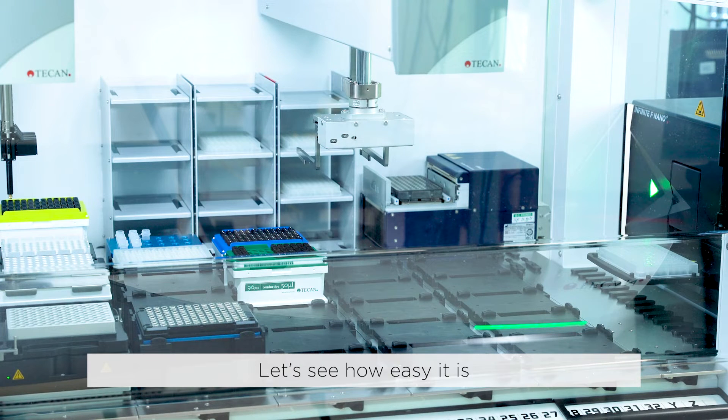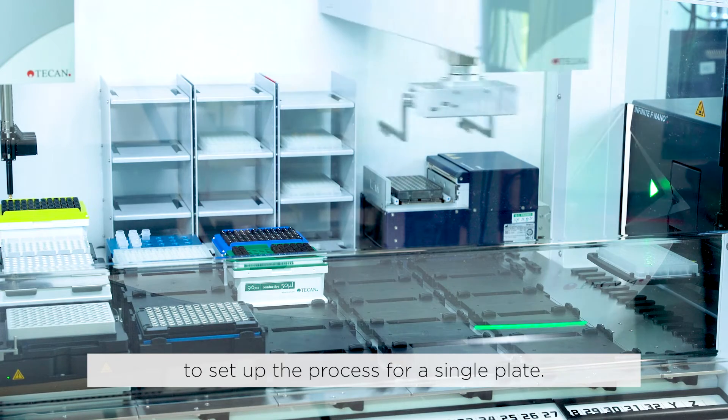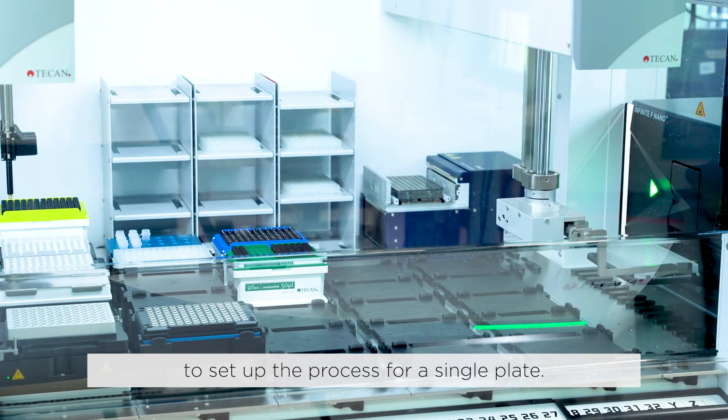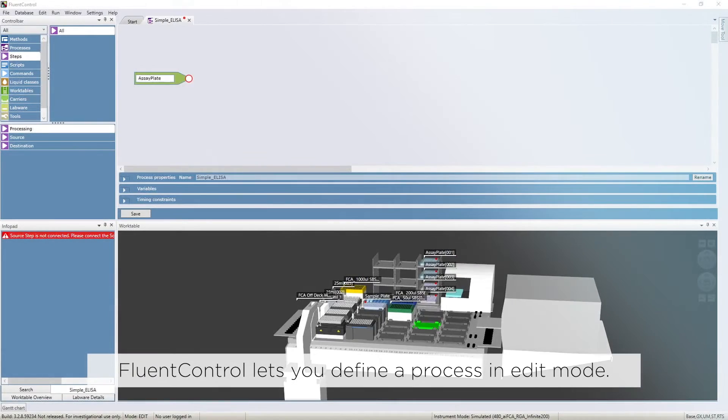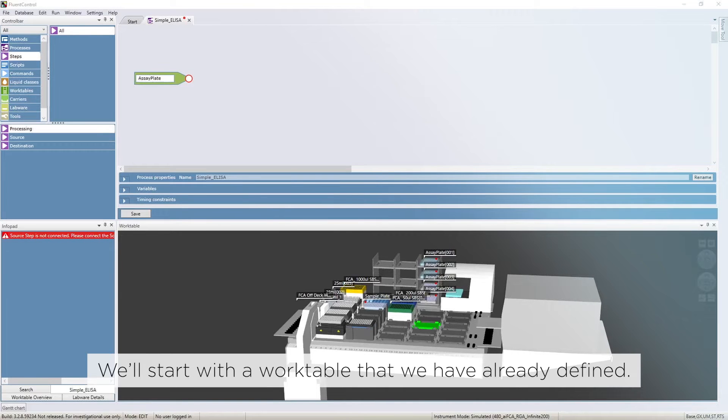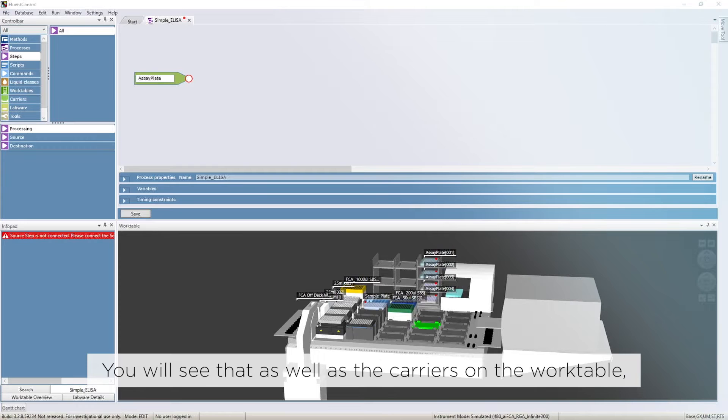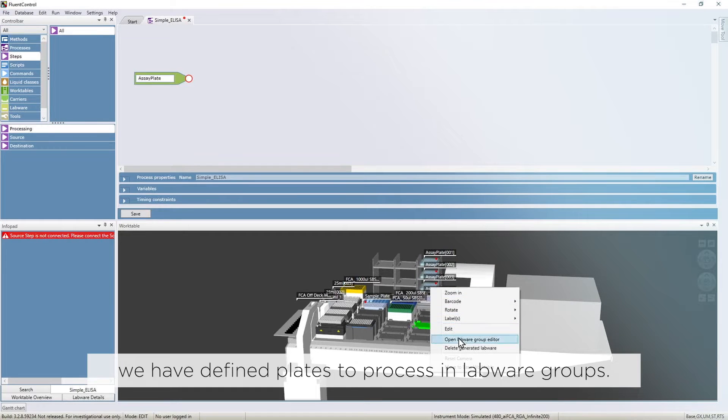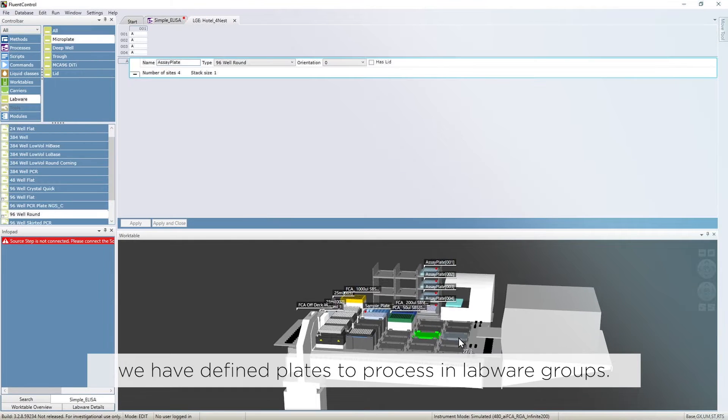Let's see how easy it is to set up the process for a single plate. Fluent Control lets you define a process in edit mode. We'll start with a work table that we have already defined. You will see that as well as the carriers on the work table, we have defined plates to process in labware groups.